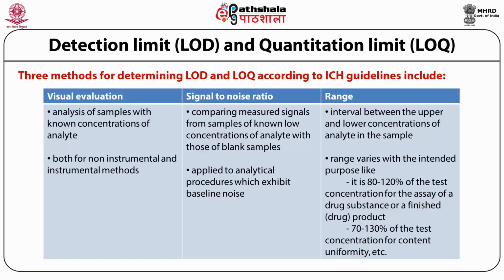Limit of detection and limit of quantitation may also be expressed by a certain formula in which the slope of the calibration curve may be estimated for an analyte. The value of sigma, or the standard deviation, may be taken from the analytical background responses of an appropriate number of blank samples. Alternatively, it can be taken as the residual standard deviation of a regression line or the standard deviation of y-intercepts if regression lines are obtained for samples containing an analyte in the range of LOD and LOQ.